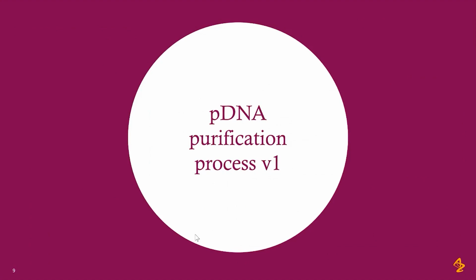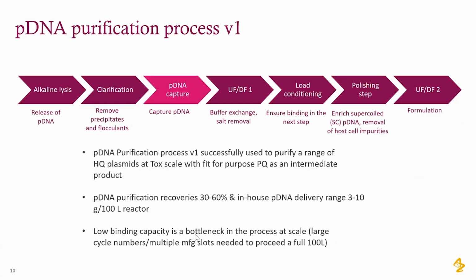So now let's move to the plasmid DNA purification process that we have developed initially and used for a variety of constructs. In this slide, you can see the whole process flow, and also there is a small explanation of what each step does and is responsible for.